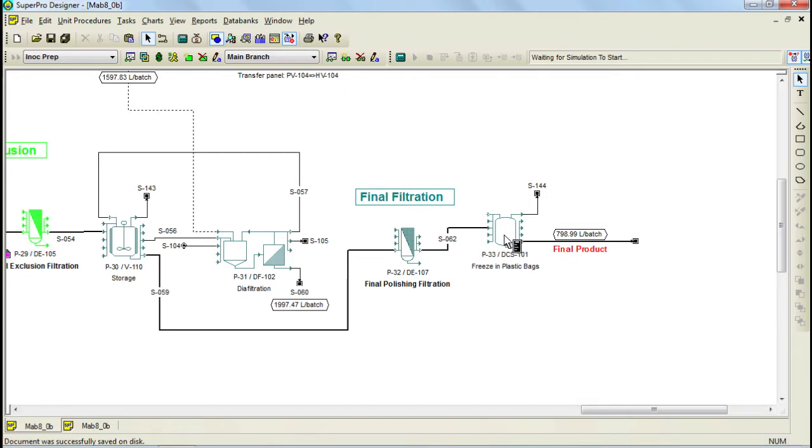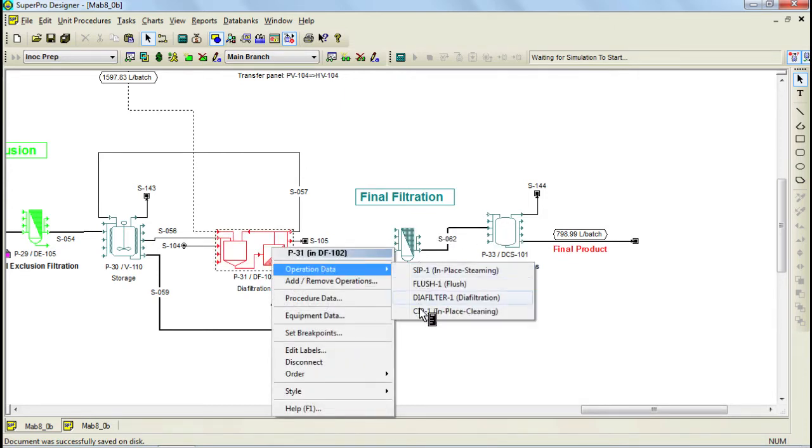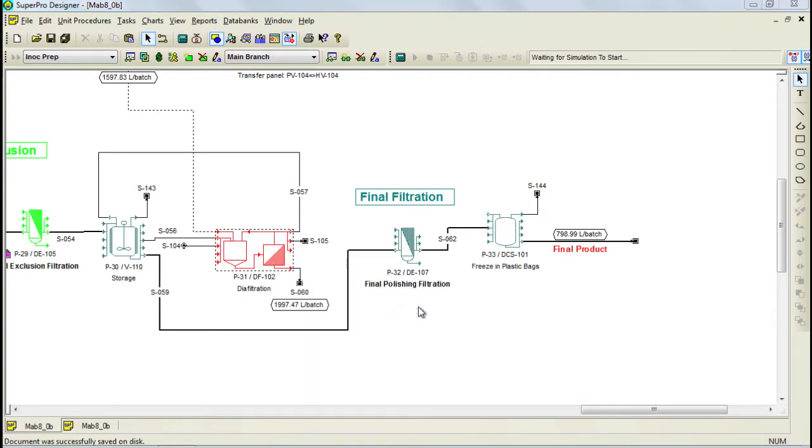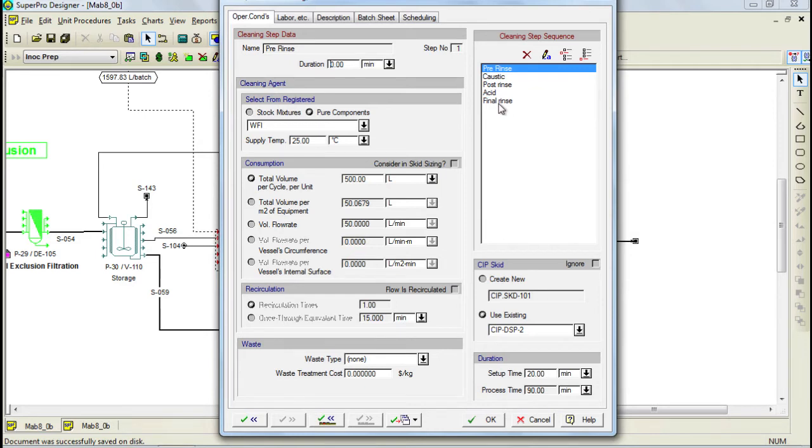SuperProDesigner allows you to schedule cleaning activities based on your own specific recipes. Through this dialog you can edit the steps that you want to carry out in your recipe. This operation accounts for material consumption and you can even track CIP skid utilization.